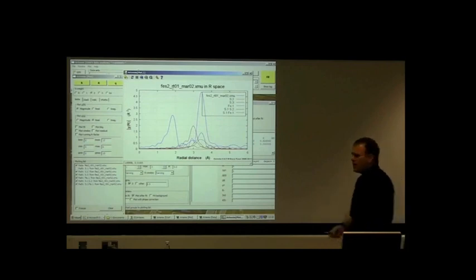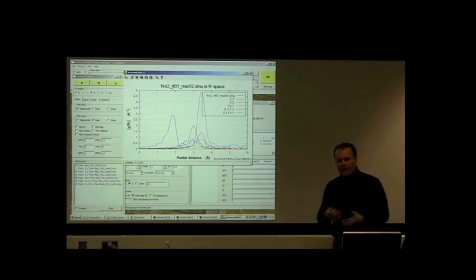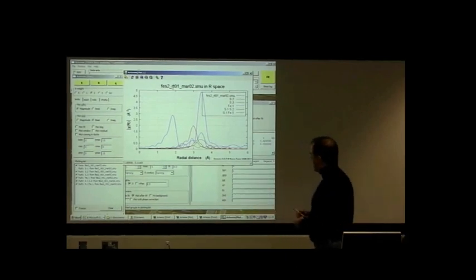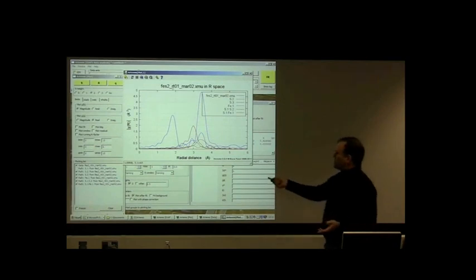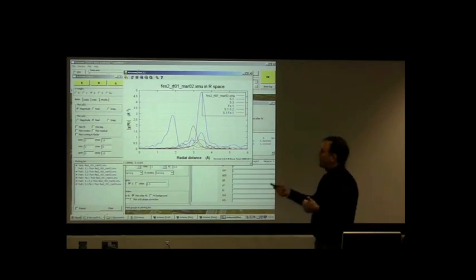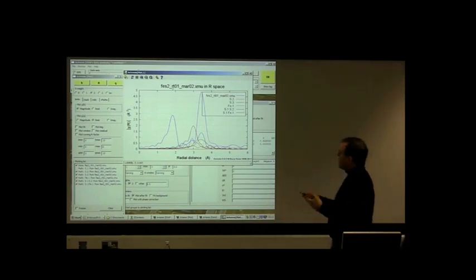So again, we're going to need to talk about how to actually do that and how to set up the fit and all the mechanics of that and all the science of that. But this is useful information. We could do a fit to the first peak only considering the first shell, but all the rest of this stuff somehow combines up to be this peak.